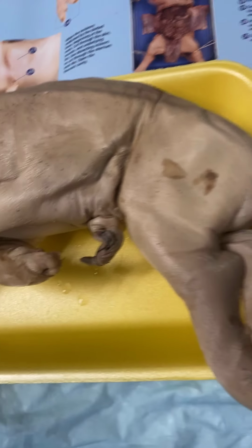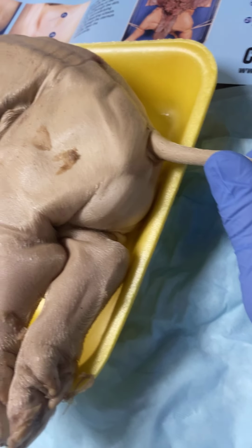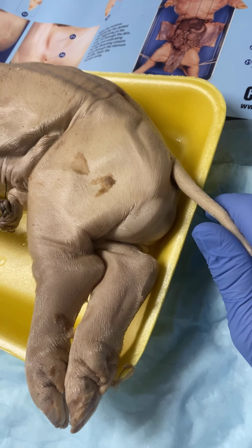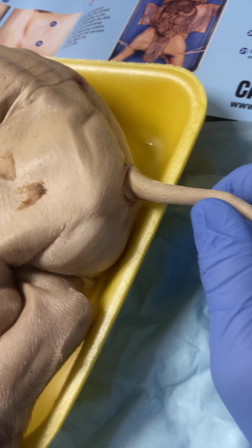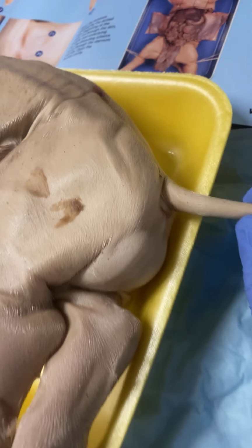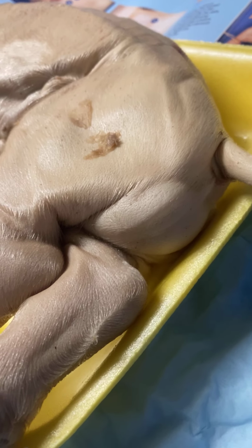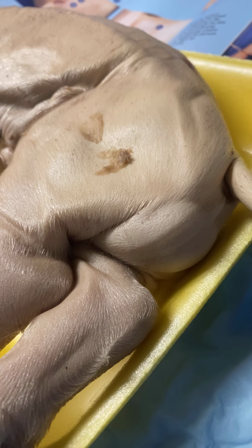Next, back here, you have the genital papilla. In female pigs, a fleshy flap that loosely covers the urogenital opening, which I believe we have a male here. And back there, you have the anus, which is the terminal opening of the digestive system through which digestive waste is eliminated. And since we have a male, we have a scrotum instead of the genital papilla, which is the sac that holds the testes and the epididymis outside the male's bodily cavity.